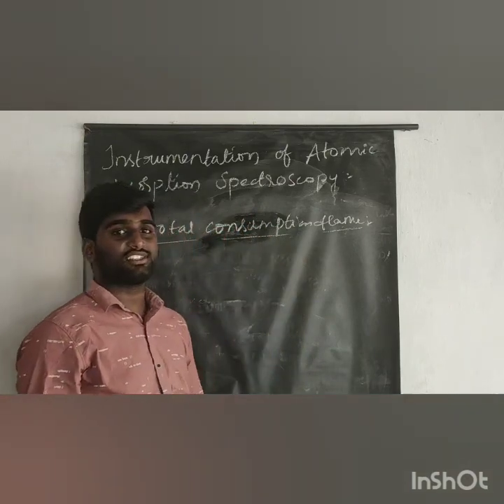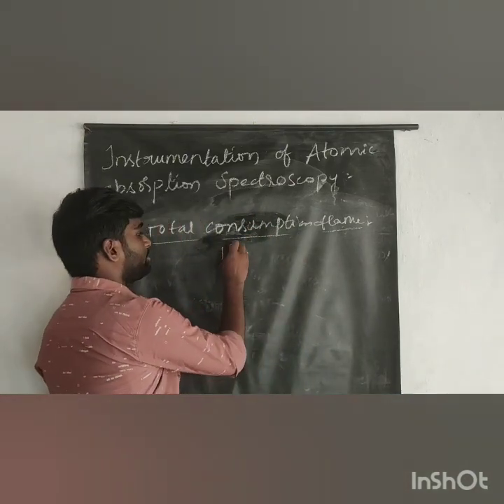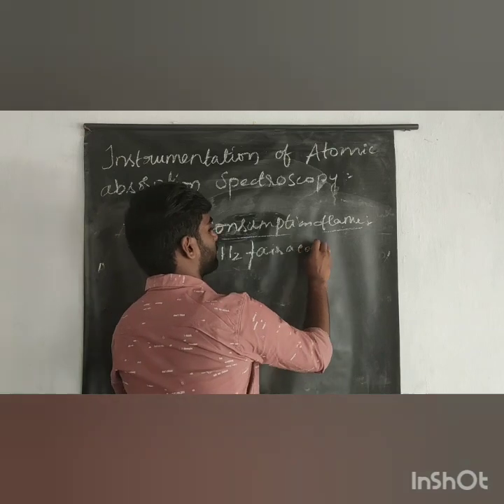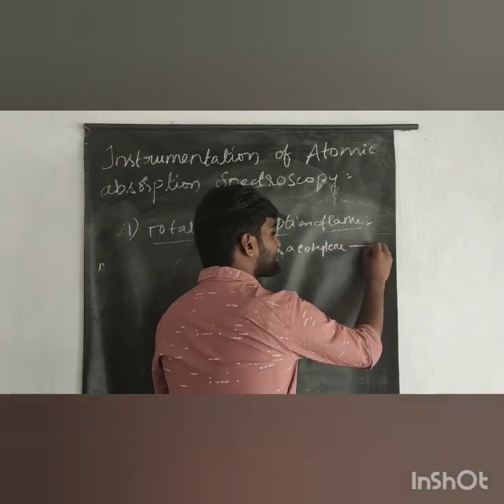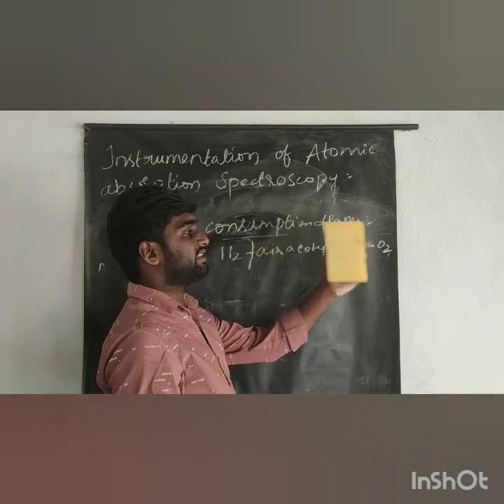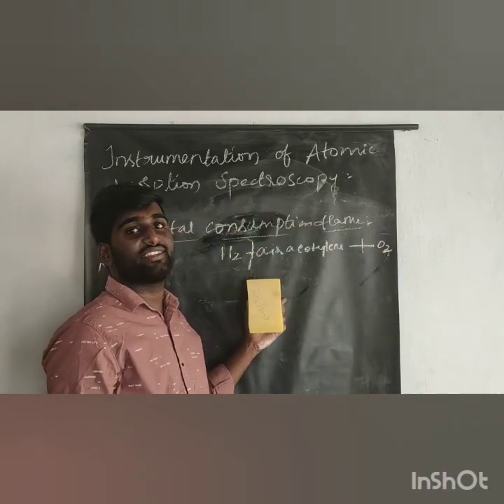So what is total consumption flame? Here in the total consumption flame we have to use hydrogen or air acetylene, and it is combined with the oxygen, and the mixture burns at the top of the burner.